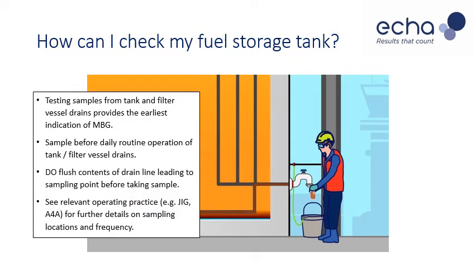Samples should be taken immediately before any routine daily dewatering procedures. But you do need to flush the contents in the drain line leading to the sampling point first, before taking the sample. We want a sample of what's actually in the tank or filter vessel, not what's in the drain line.